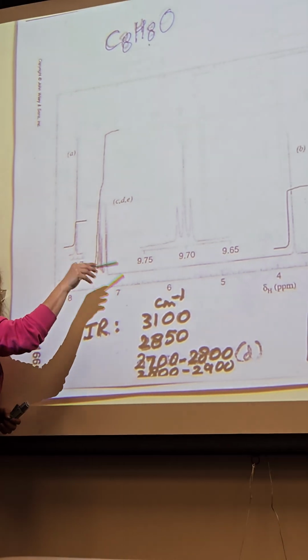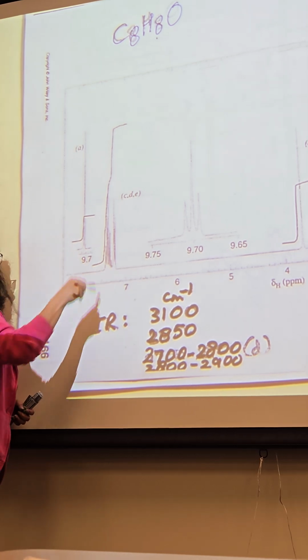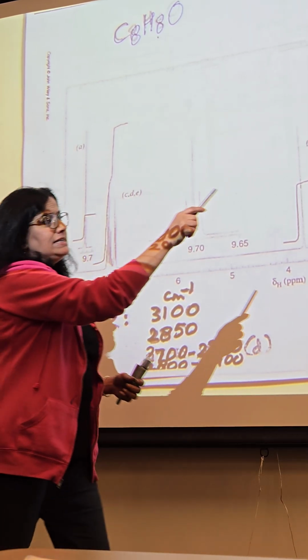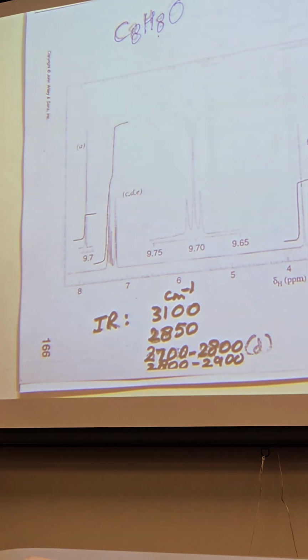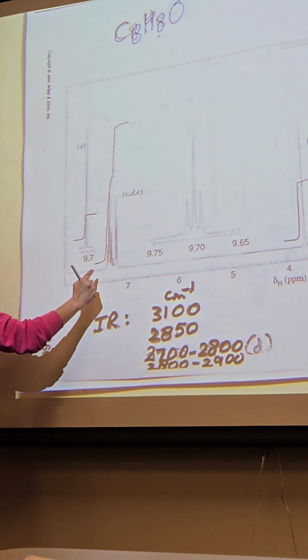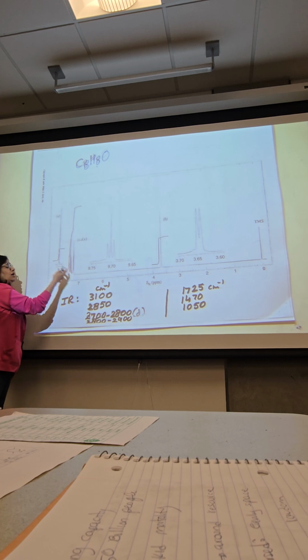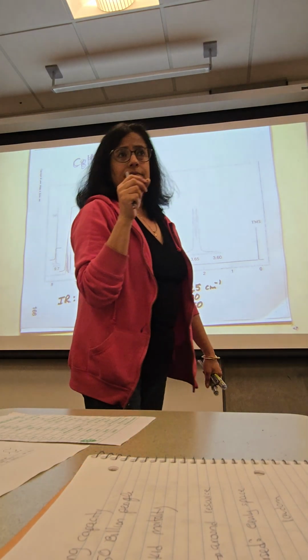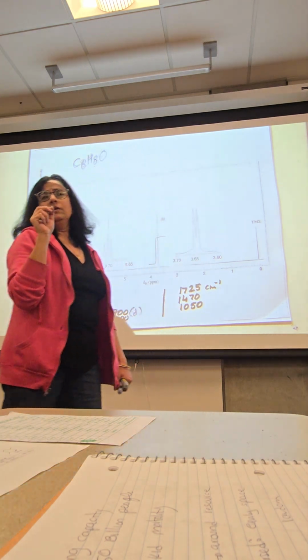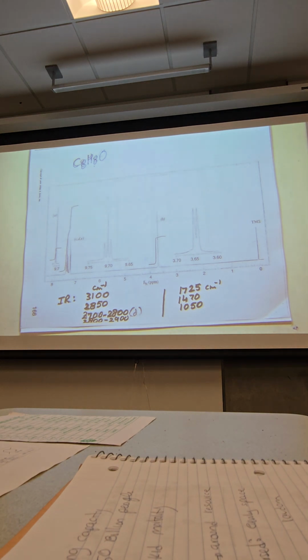Where do benzene hydrogens show up in proton NMR? Right there, this area. From 7 to 8, 6.8... 6.5 to, yeah, exactly. So the point is, I see IHD 5. Oh, could there be a benzene? Suddenly I look in this direction, I see, oh, yep, absolutely. There are signals there which confirm that this molecule has a benzene ring in it. Everybody okay? We'll do more with it as we go forward. Just keep that clue in mind.